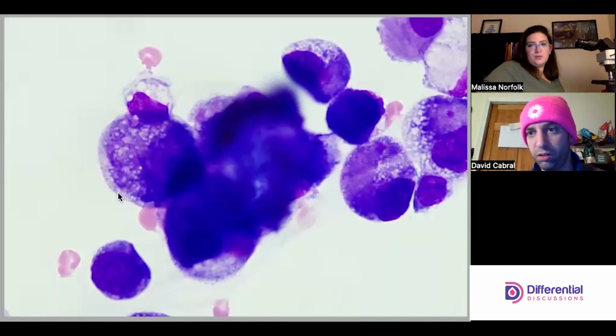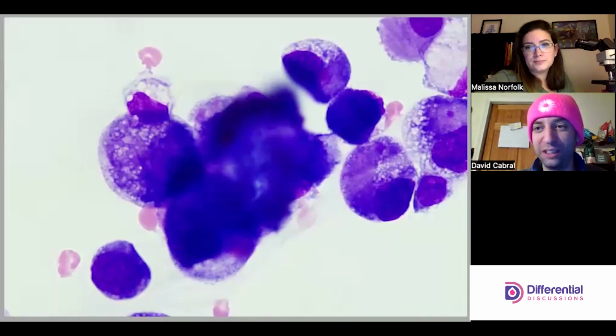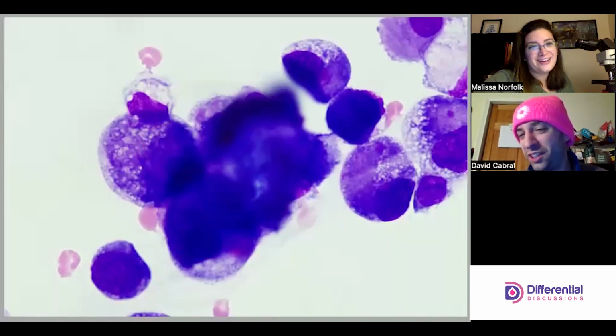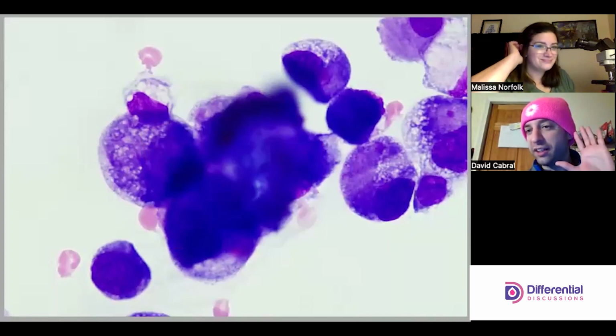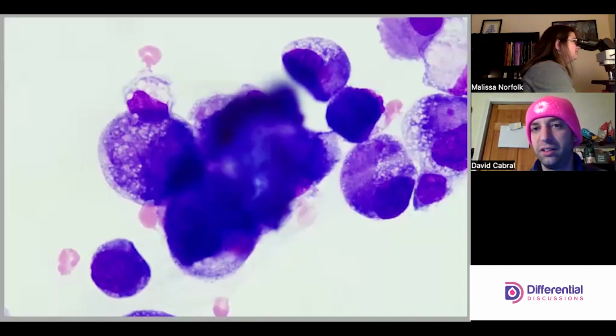But even just looking at this one underneath it here, is this the nucleus? Yeah, that's a good point. I think I've gotten so lost in how poorly staining these are that there's a genuine question. Or even look at the nuclear membrane. I assume this is part of the nucleus here. If it's not, that's really weird. Yeah, cytoplasm. Our inability to distinguish isn't a failing on us. It's just, when the slide sends you signals like this, you have to be receptive to it, because there's just a bunch of cancer here.